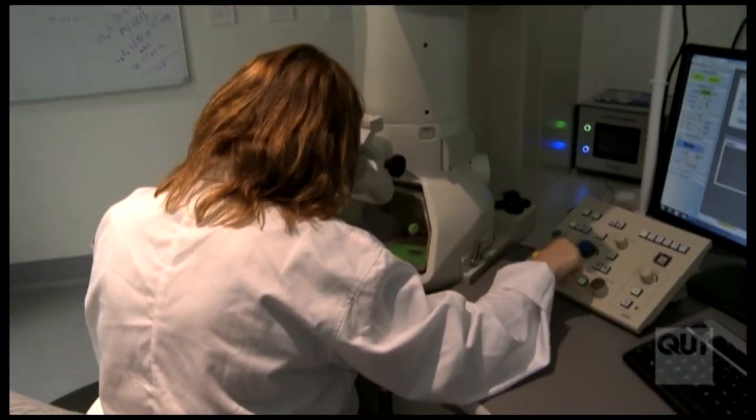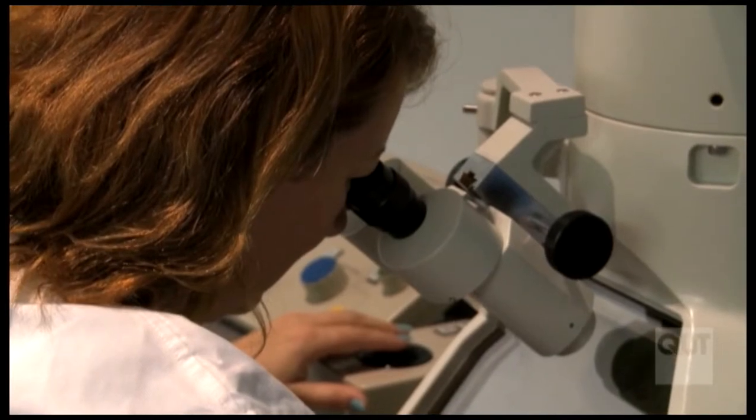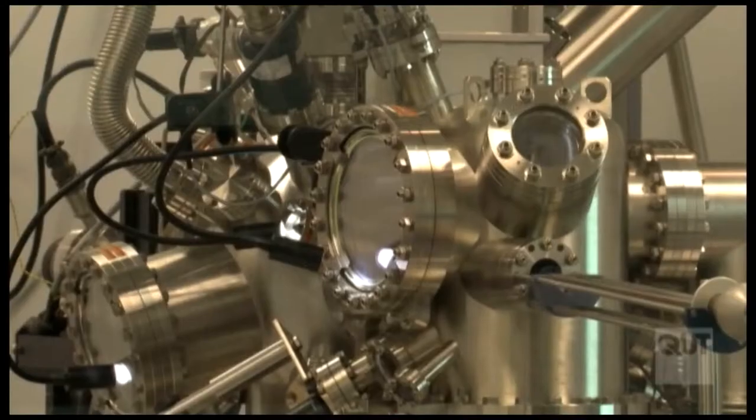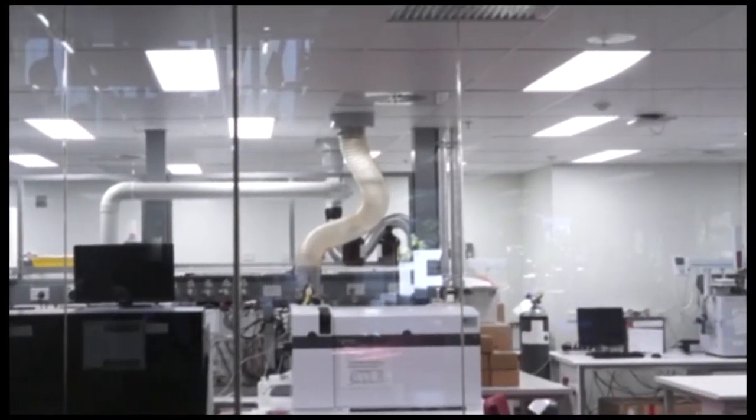The Institute's central analytical research facility is equipped with about $17 million in cutting-edge equipment for analysing the physical, mechanical, chemical and biological properties of solids, liquids and gases.